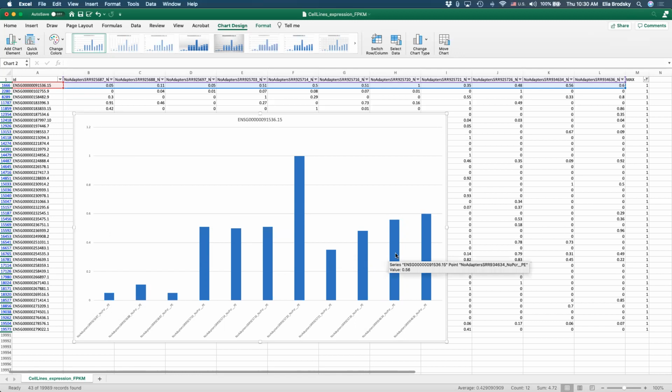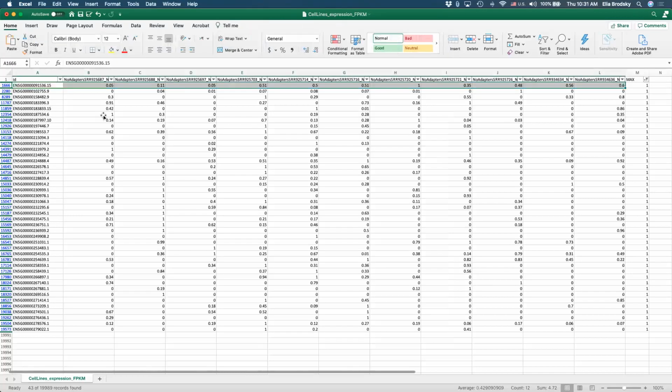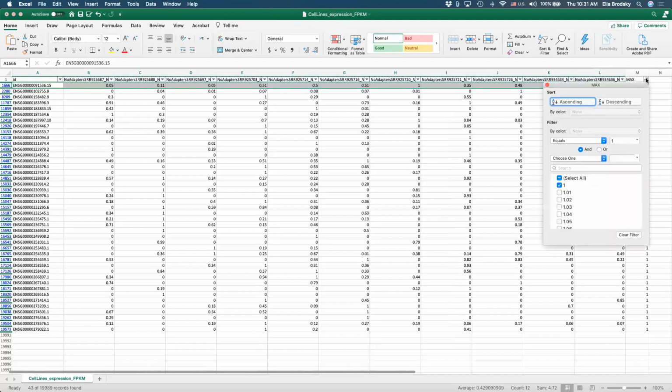Since almost all of my samples are represented within this variance of 0 to 1, I will never find any significance, because an expression level should be at least a number that gives me some kind of meaningful difference. So in this case, this is never going to be meaningful. Even if I take 2, it's never going to be meaningful. That's why, before moving on with other types of analysis, you might want to filter this out by a certain number.